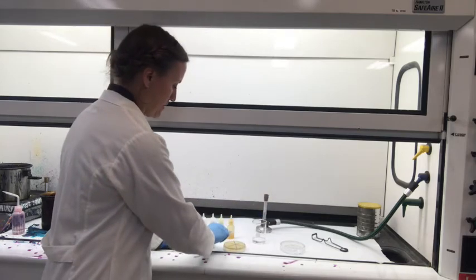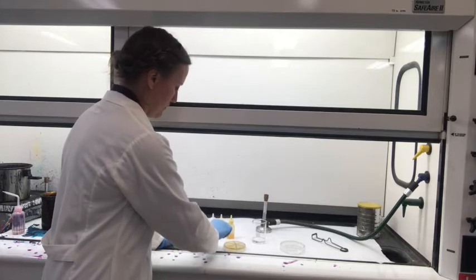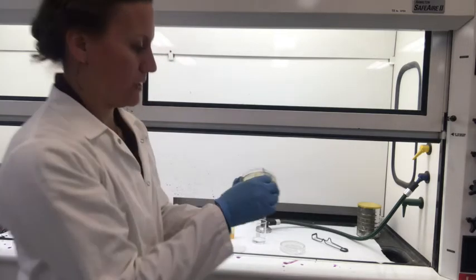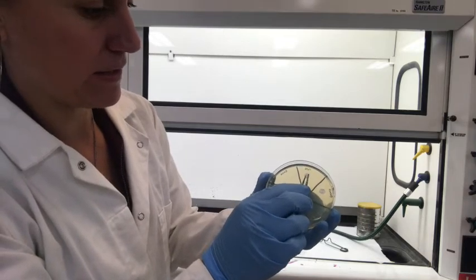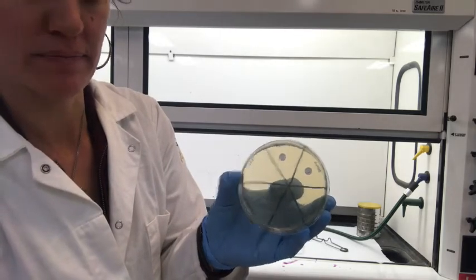And with my forceps, I'll take my disc, again making sure that it's not dripping, and put it directly onto the agar. And I'll just press it down lightly, and now I have my disc on the agar.